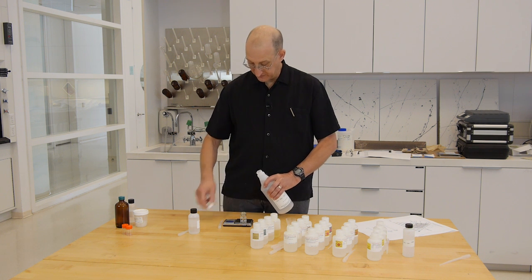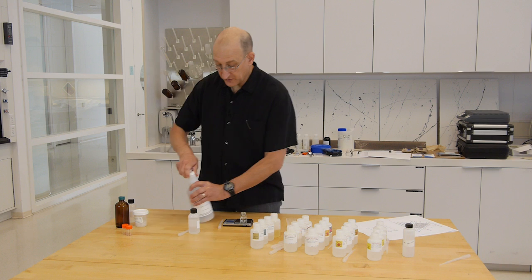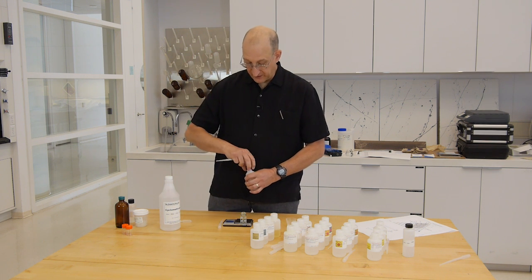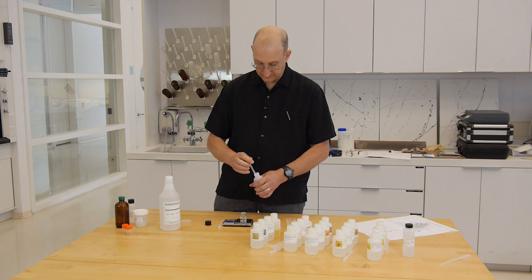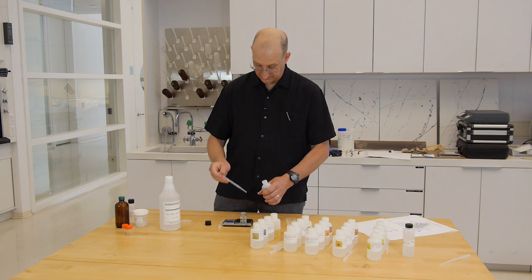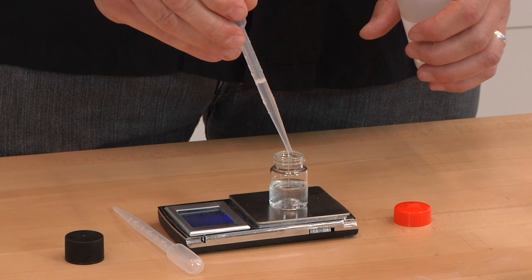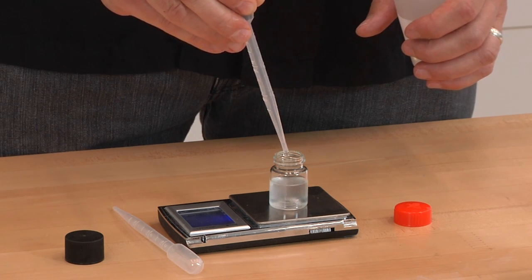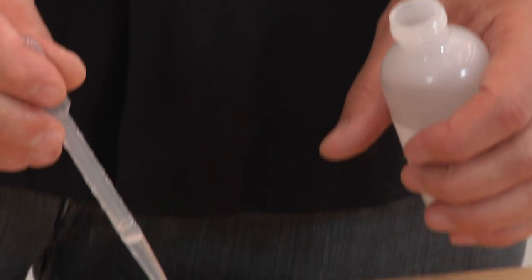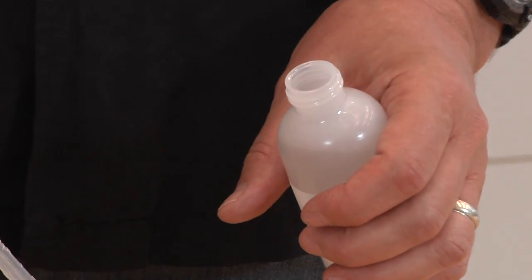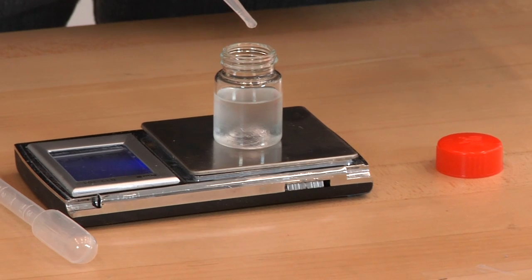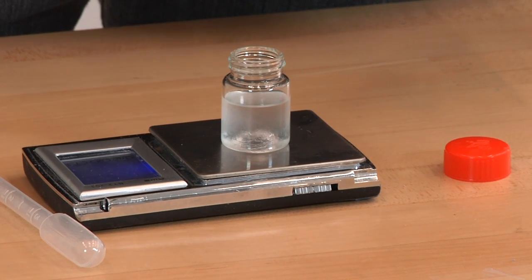We tare the balance, and we'll do 25% of the ECOSURF EH3, or 2.5 grams.